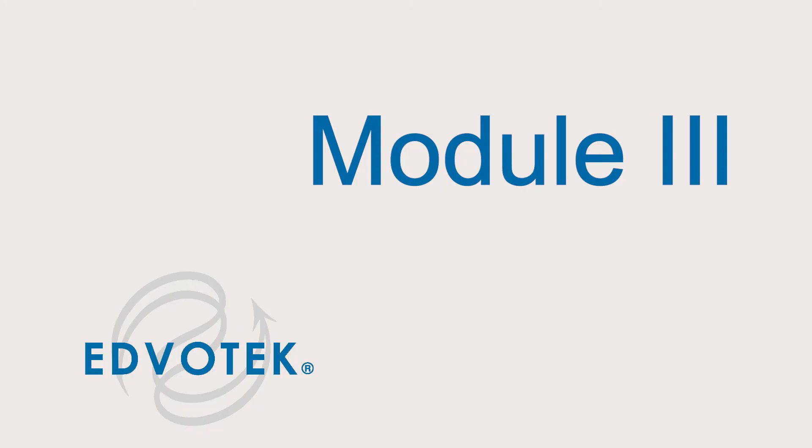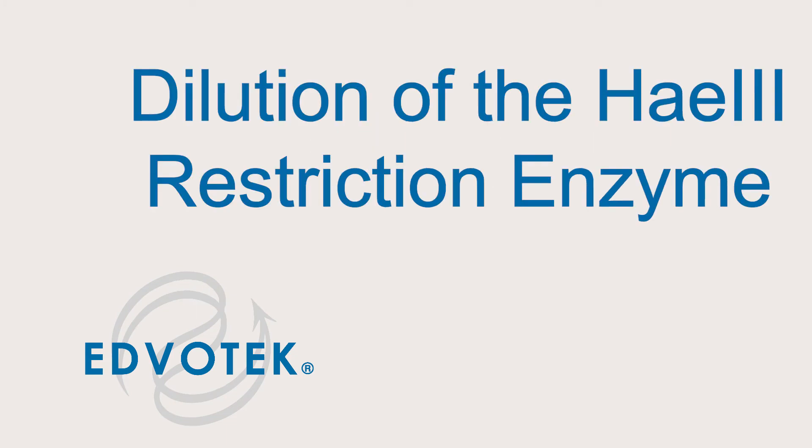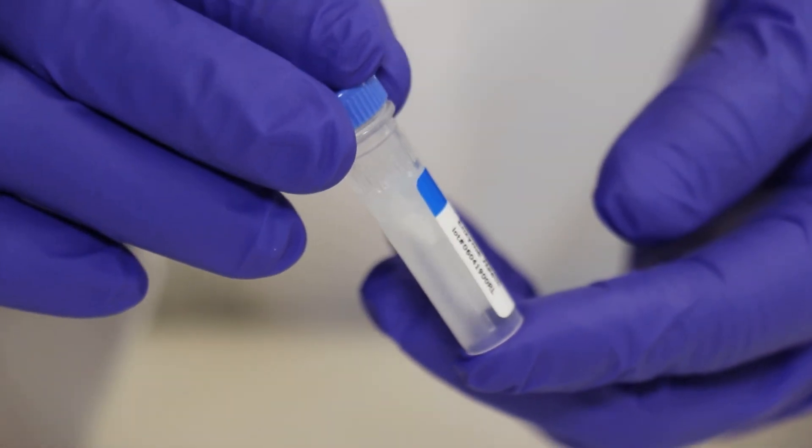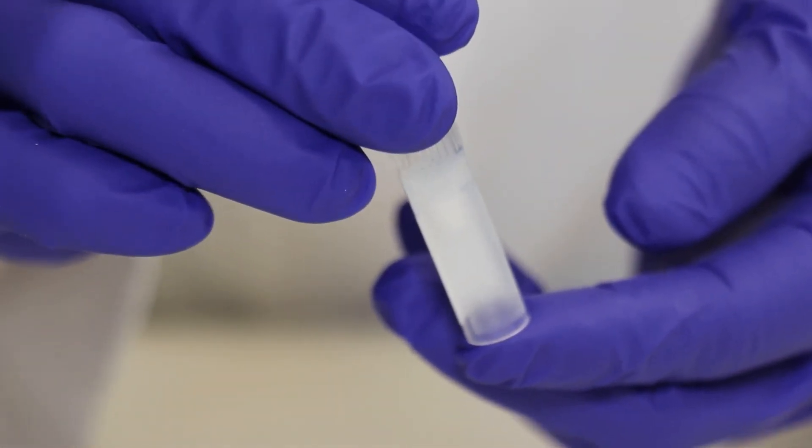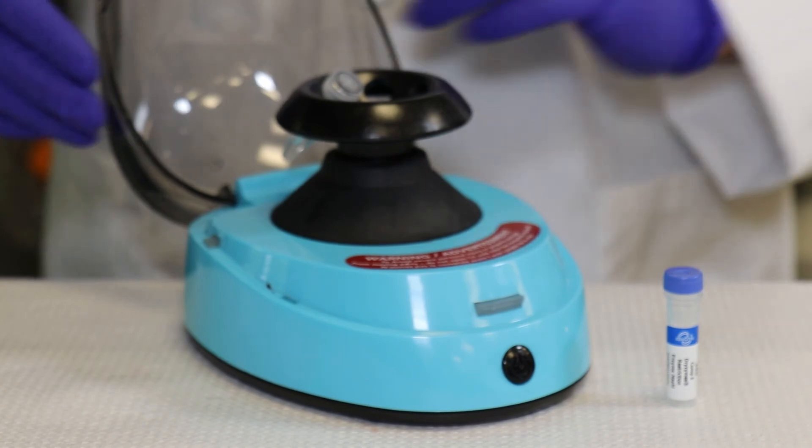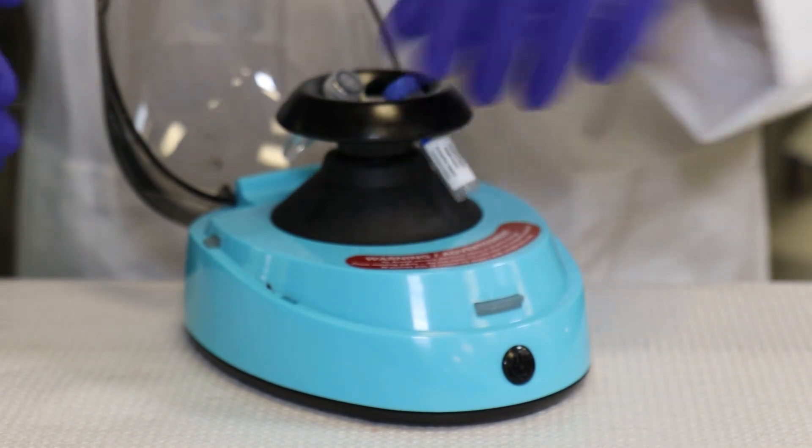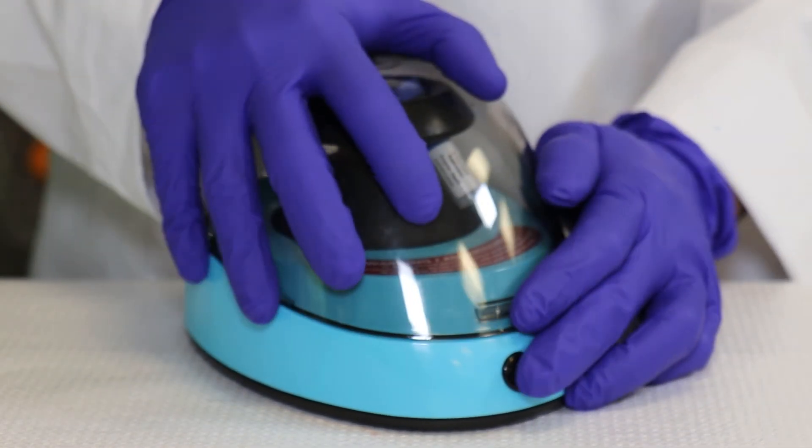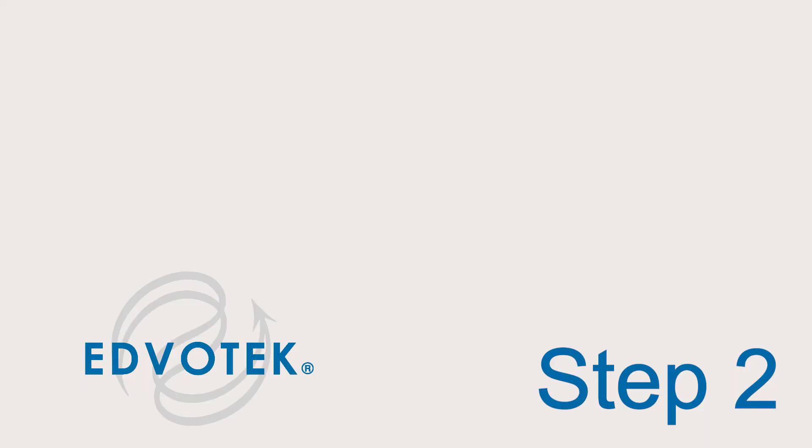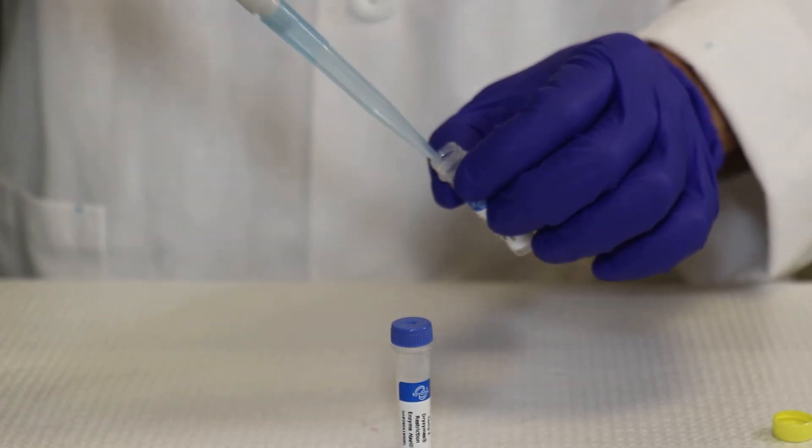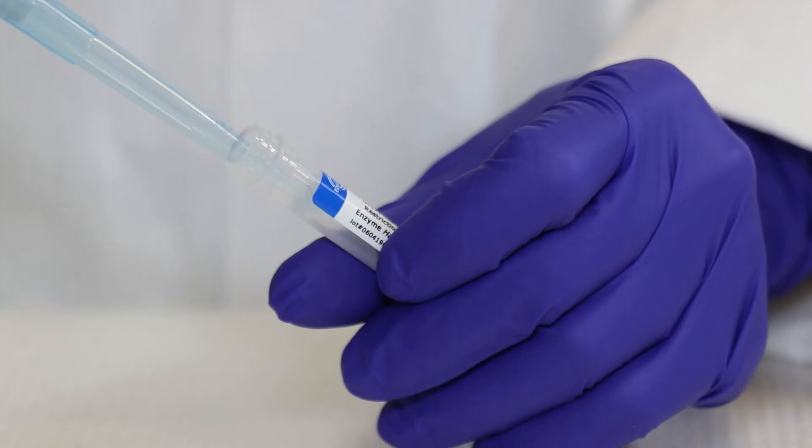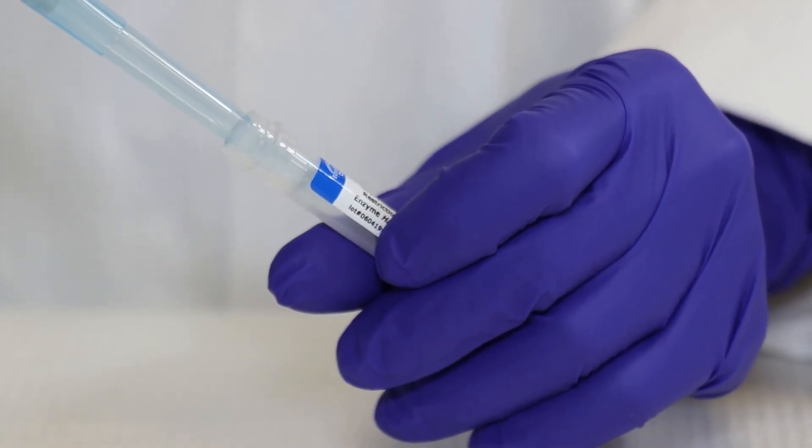Preparation for Module 3: dilution of the H3 restriction enzyme. Step 1: make sure that the solid material is at the bottom of the tube of Component E dryzyme restriction enzyme H3. If not, centrifuge the tube at full speed for 20 seconds. Step 2: add 200 microliters of Component F restriction enzyme dilution buffer.